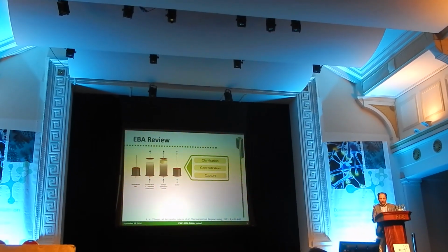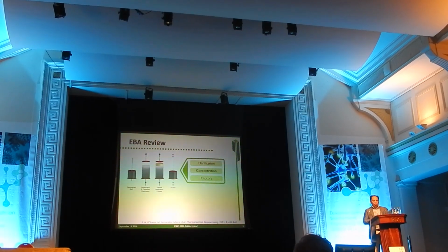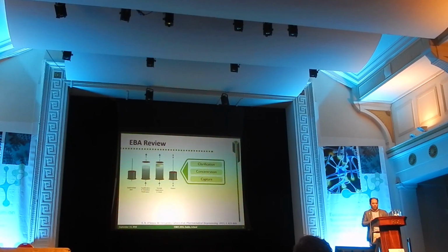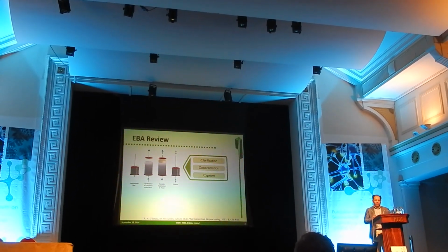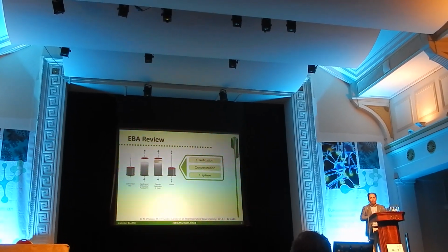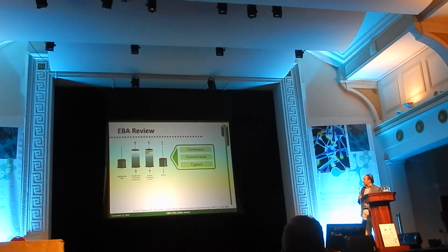There is something very interesting about this way of operating chromatography, and this is the fact that for the first time, we chromatographers are exposed to the practice of introducing a crude feedstock directly to the column. Common knowledge in chromatography would indicate that you need to very extensively clarify a feedstock before going to a chromatographic column, right? And this is what you do normally.